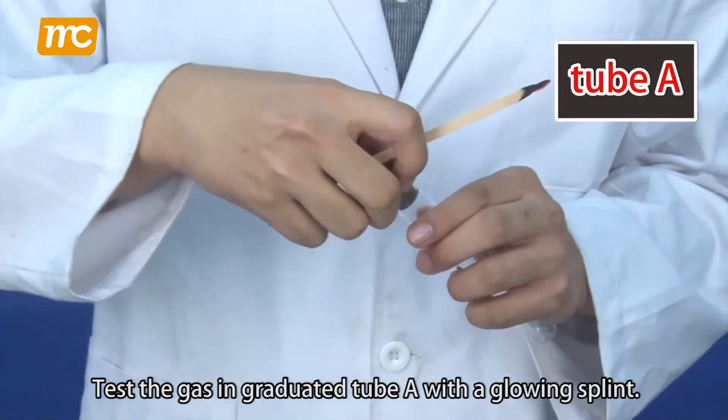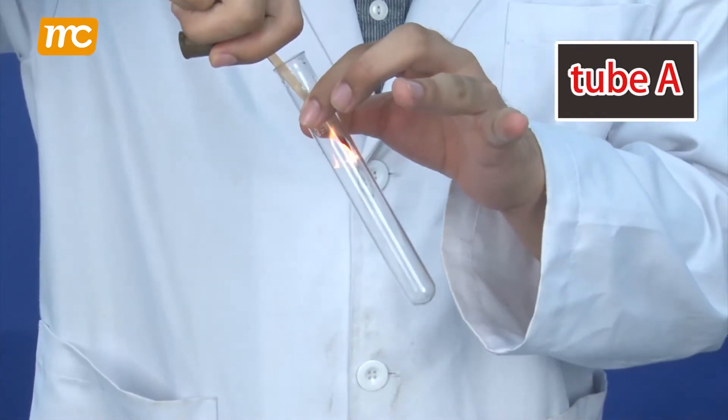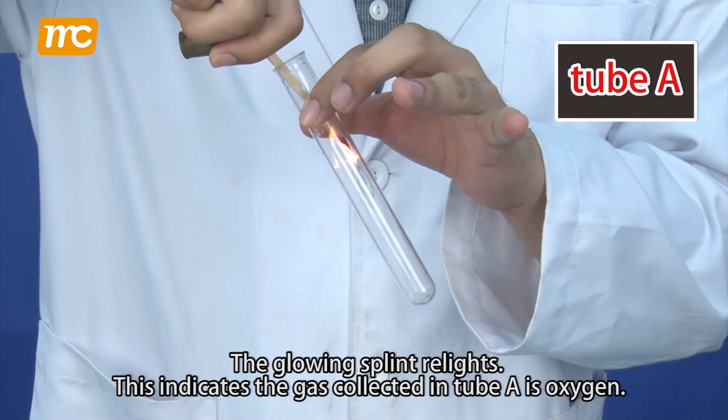Test the gas in graduated tube A with a glowing splint. The glowing splint relights. This indicates the gas collected in tube A is oxygen.